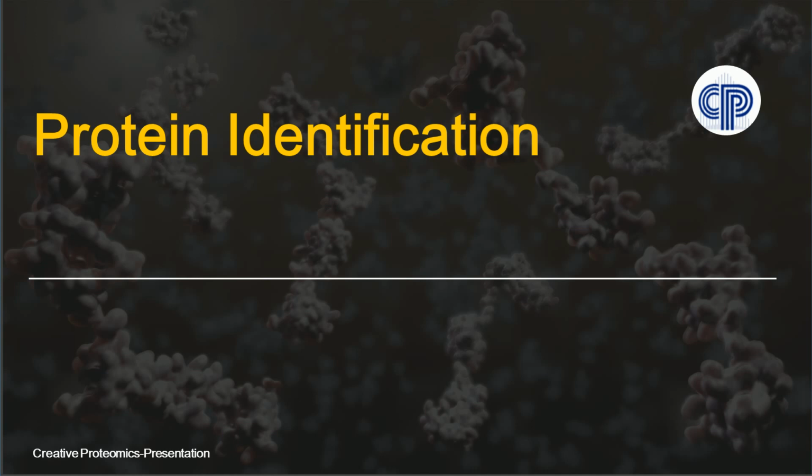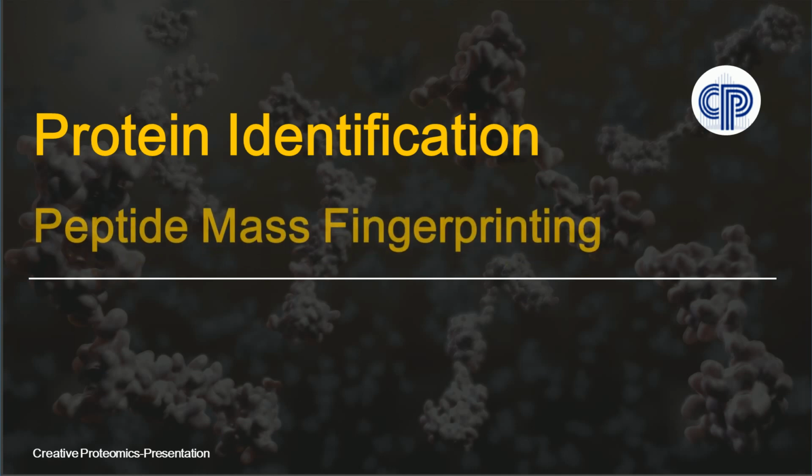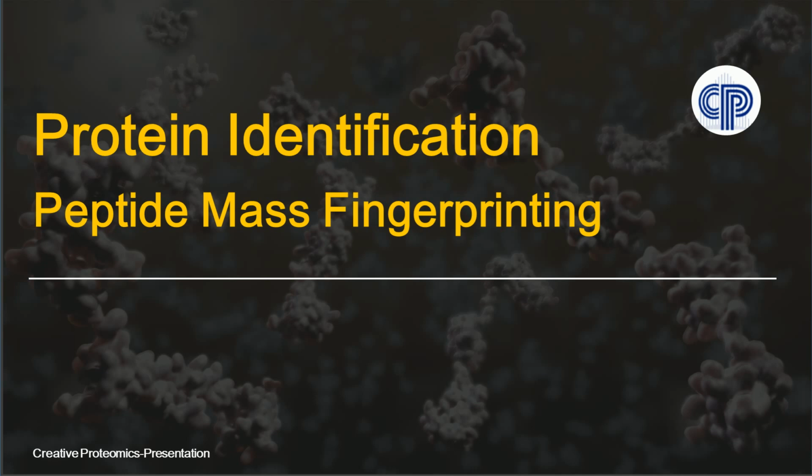Today, we are going to learn some basic knowledge about peptide mass fingerprinting. It is a technology to identify proteins.